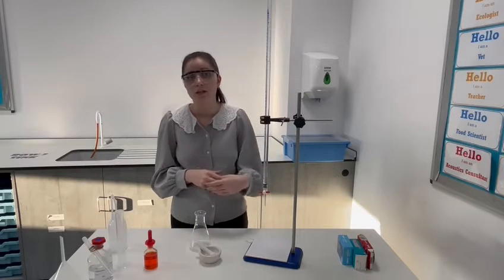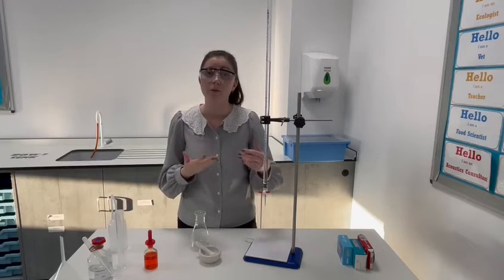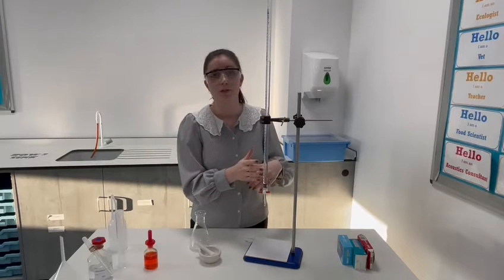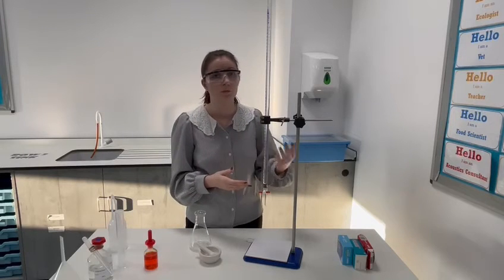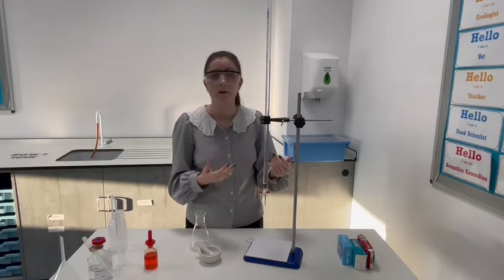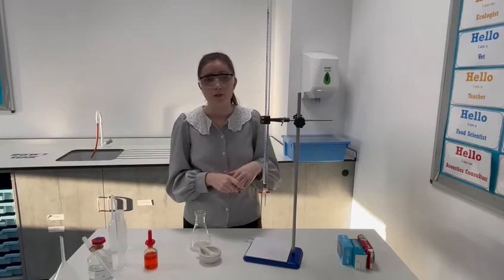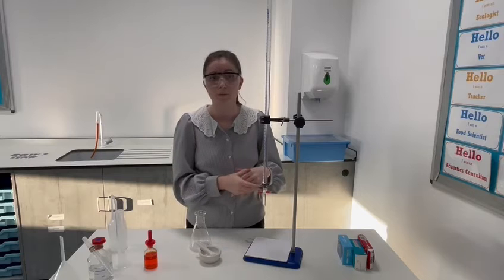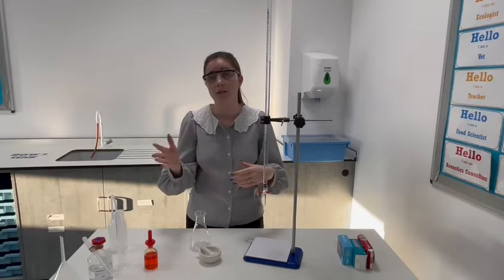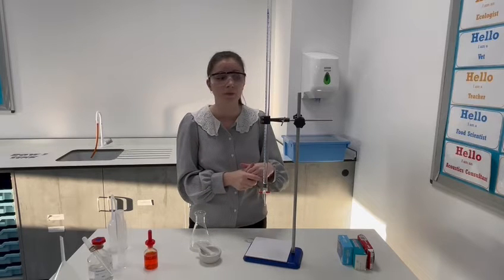As well as the level of challenge leading up to the practical, in terms of how it's actually done, there are various ways to do it. So I'm going to show you this practical using a burette, which some students might be familiar with and some students might not. It does require quite a high level of skill to use a burette. Our GCSE chemistry students might have already come across burettes when studying titrations, or perhaps they're learning about titrations in a future topic, so it might be nice to bring it in now at this point.